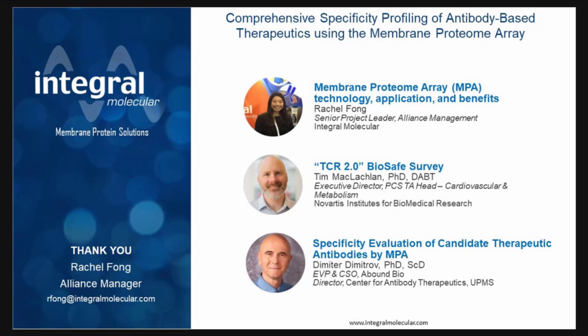Thank you. Our next question for Dimitar. How important do you think it is to test antibodies targeted for viral proteins for specificity compared to testing antibodies targeted at human proteins? Have you had any personal experience with off-targets for your SARS-CoV-2 antibodies?